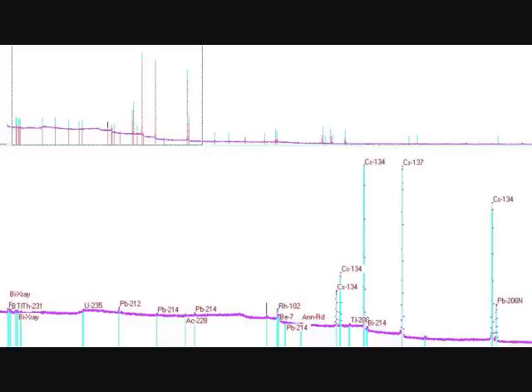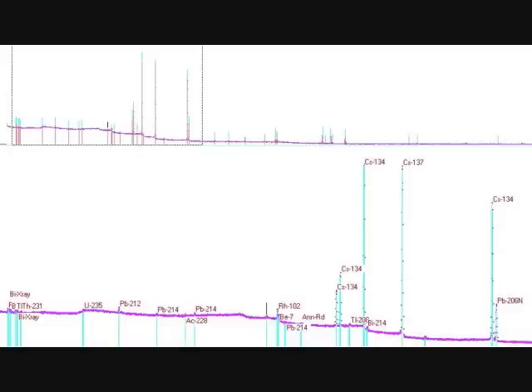Here is the complete spectrum, as taken during a 24 hours measurement of one of the 50 gram samples. On the top, you can see the spectrum as a whole, and on the bottom, you can see our area of interest that has been marked on the top left. So, the question was, is there any detectable amount of radioisotopes from Fukushima or general nuclear incidents detectable in Tokyo? And the answer is clearly yes.